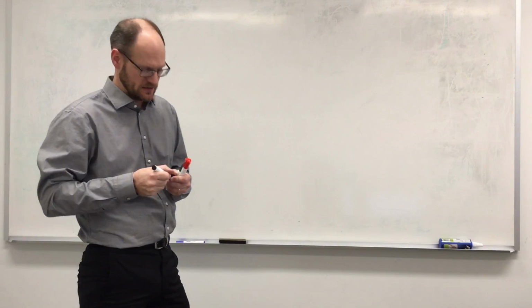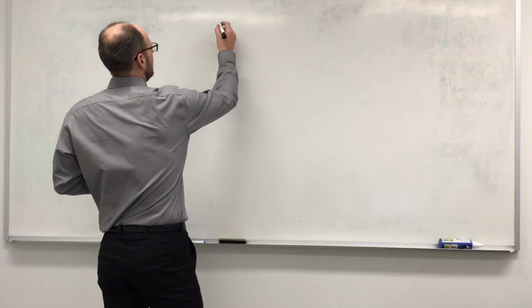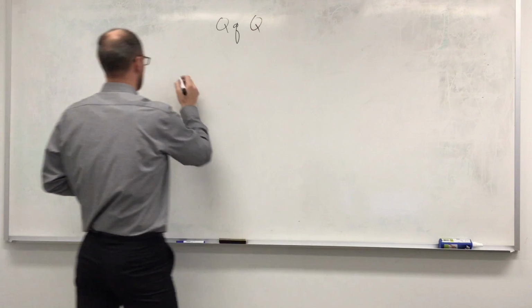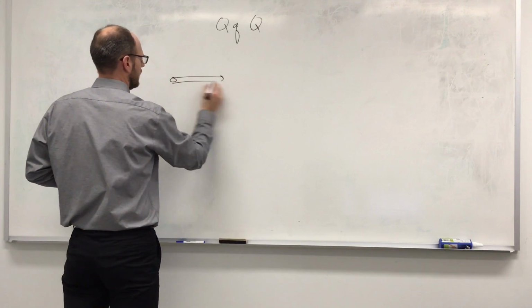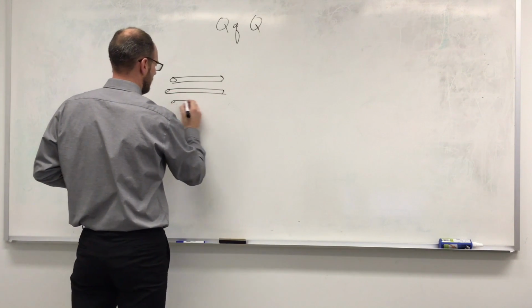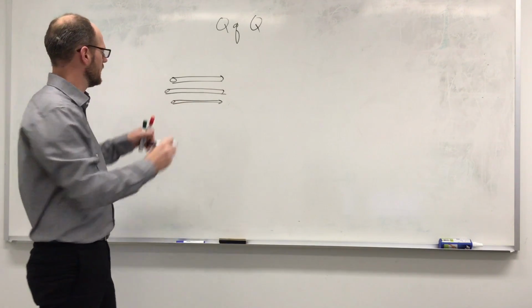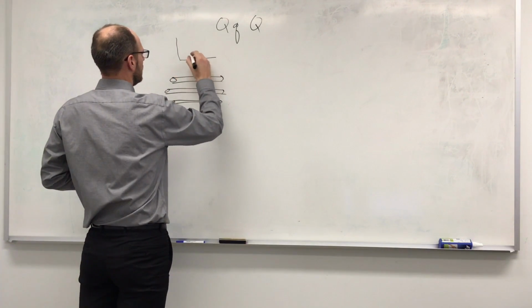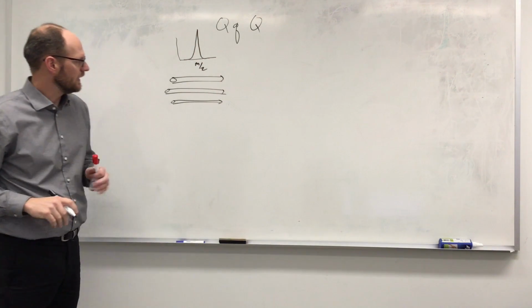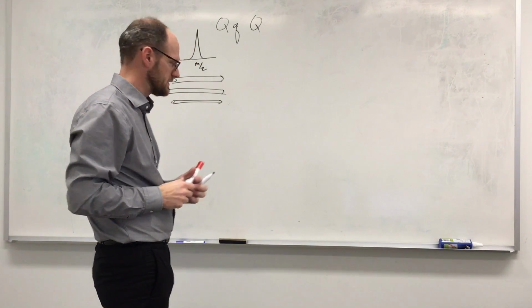All right, so here's our next topic. We know how a single quadrupole works, how it filters mass. And now the question is how you turn that into a mass spectrometer. So if you've got your quad here, we'll redraw it quickly. We know now that what the quad allows you to do is filter out ions with a particular m over z. It's a pinhole that only allows a particular mass to charge ratio through.